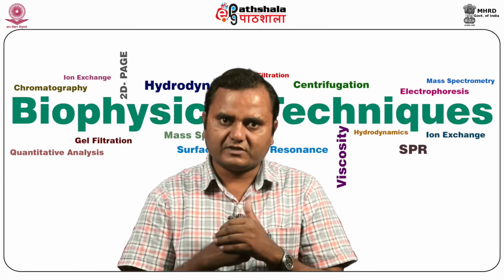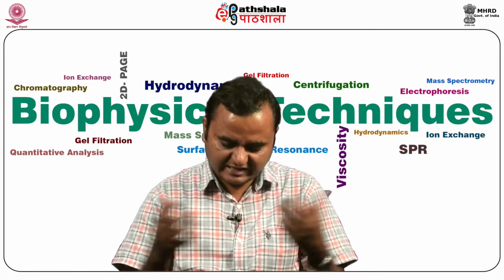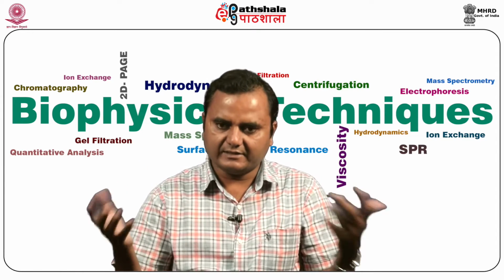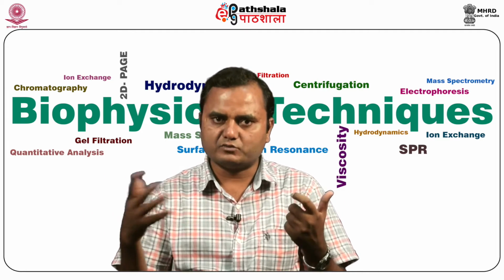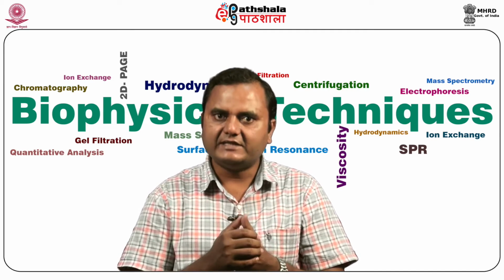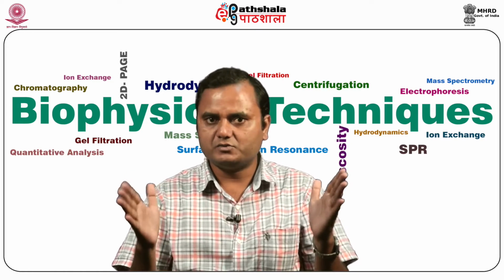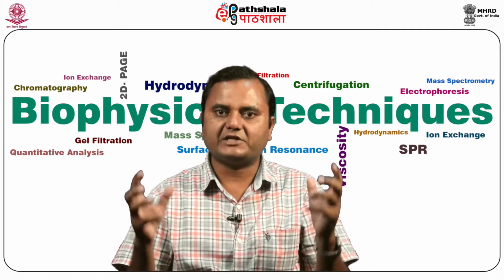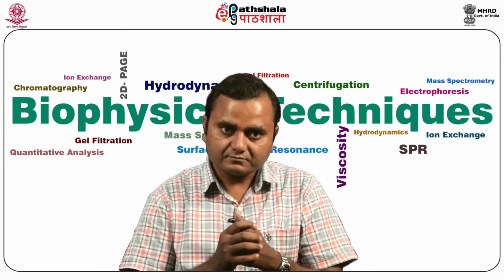It is also used for the analysis of associating systems. For example, if you have 2 proteins, or 1 protein forming an oligomer with reference to a change in certain physical conditions, then that can be determined by using ultracentrifugation. It is also used to analyze the stoichiometry, what is the ratio of 2 molecules, 1:1, 1:2, 2:1, like that.